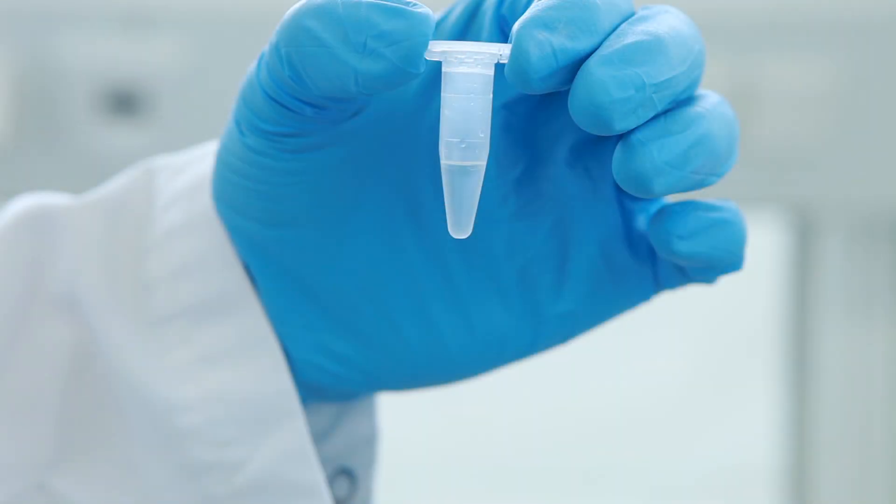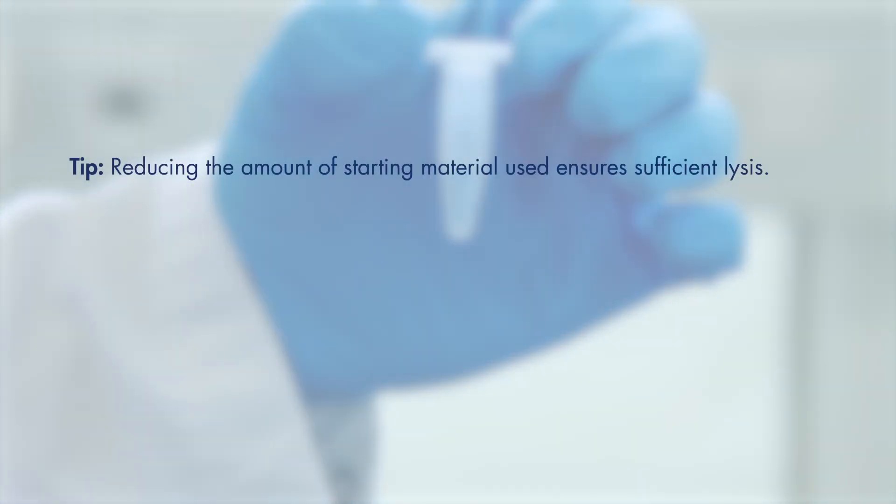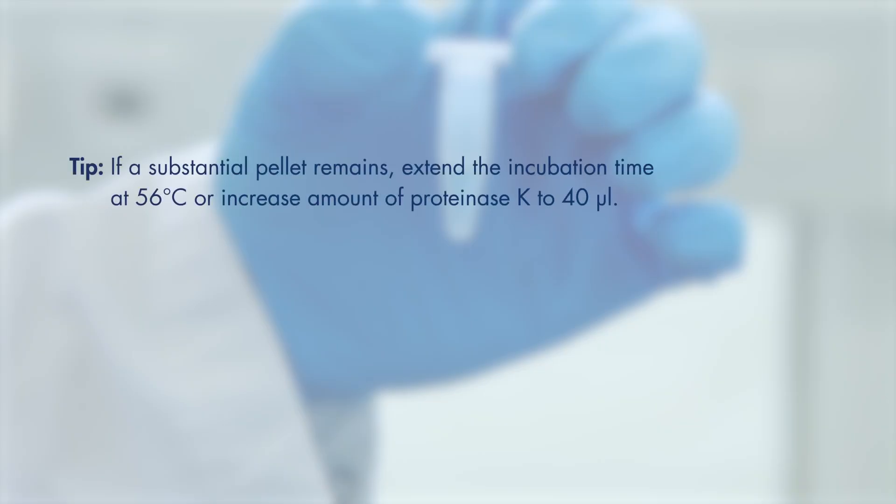To increase the DNA yield, try the following tips. If a pellet remains, extend the incubation time or increase the amount of proteinase K.